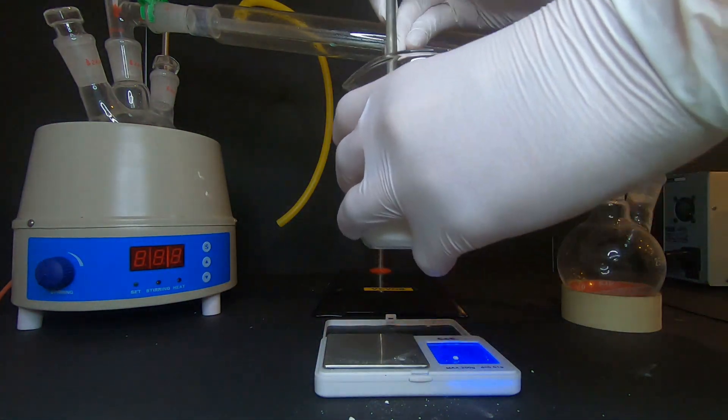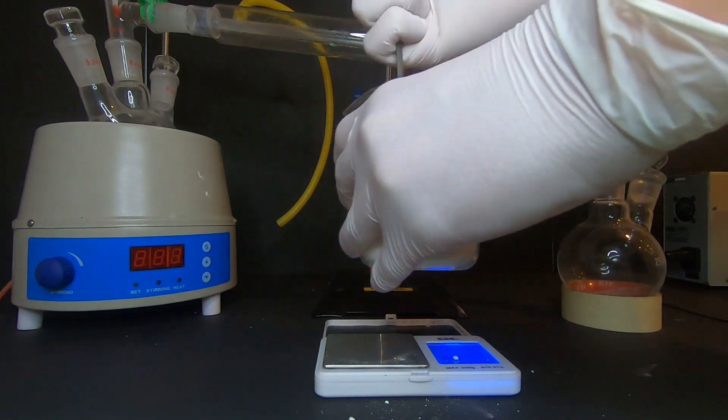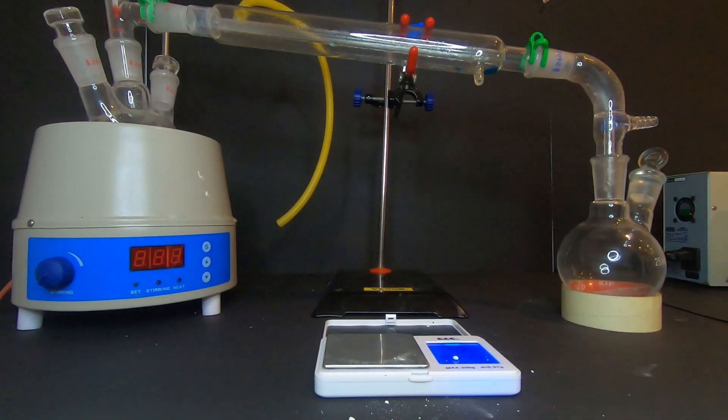Now we need to mix these two compounds and put them in our distillation apparatus. Then we will add the adipic acid in a beaker.